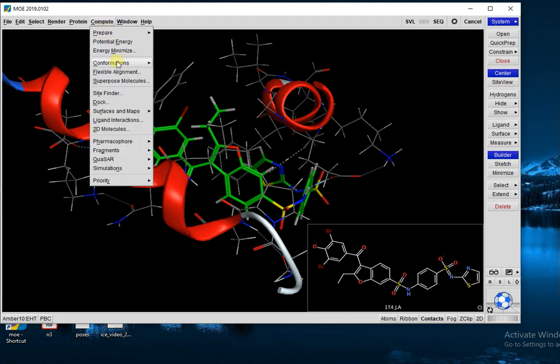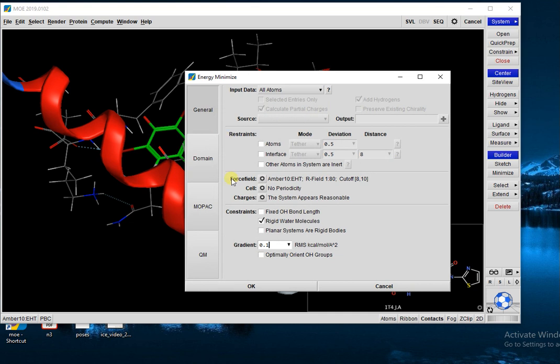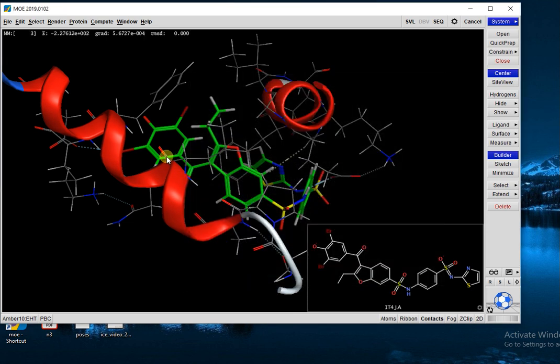Now next step is Compute, Energy Minimization. In Energy Minimization, you keep the gradient low and press OK. It will take few seconds or few minutes and you wait for it. When it will be done, then no numbering or figure will be shown here. You will then simply save it.